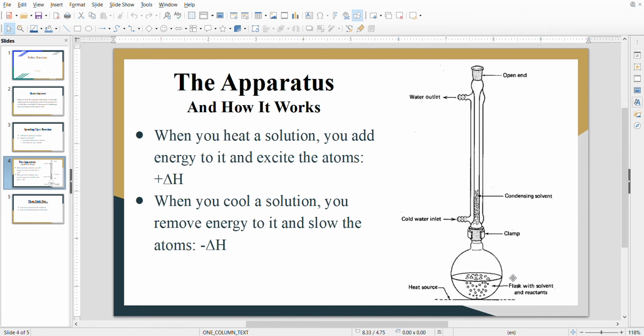You're going to use a clamp to attach a condenser, one with both arms far apart, to the top of the round bottom flask. Also stabilize the condenser with the clamp attached to the ring stand. To the lower arm, attach a hose connecting it to the water spigot, and to the higher arm, connect a hose and let the water drain into the appropriate sink.